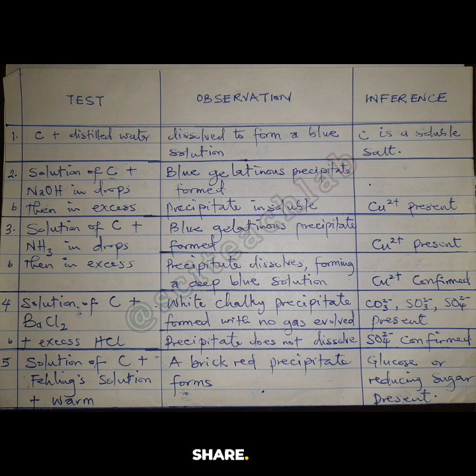But you have to narrow it down. Which one is it? Is it CO3 2-? Is it SO3 2-? Is it SO4 2-? Because you will not confirm all 3 of them. You have to check for a confirmatory test to find which of the 3 ions it is.